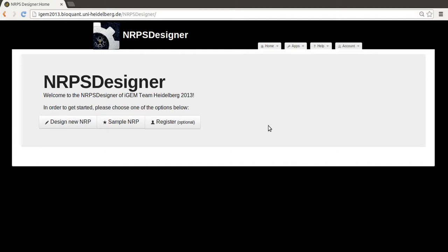Welcome to the new and highly improved version of the NRPSDesigner. In this video tutorial, I'd like to show you what the NRPSDesigner does and how you can use its core functionality. In order to get started, you can either choose this app here or just click on this Design New NRP button.